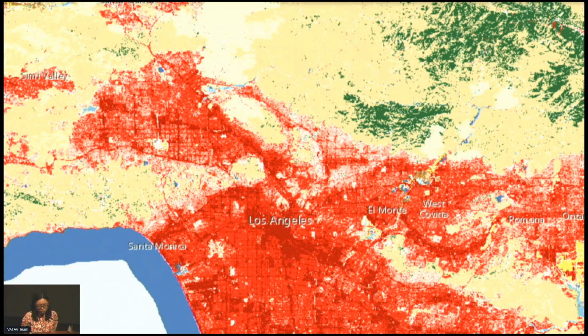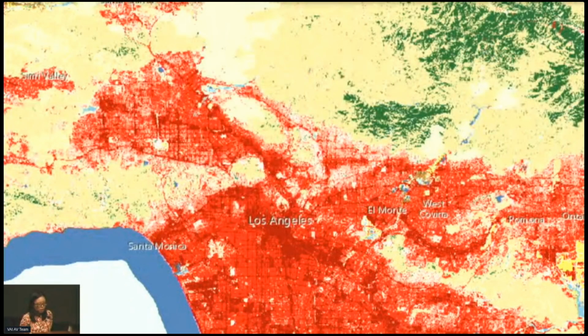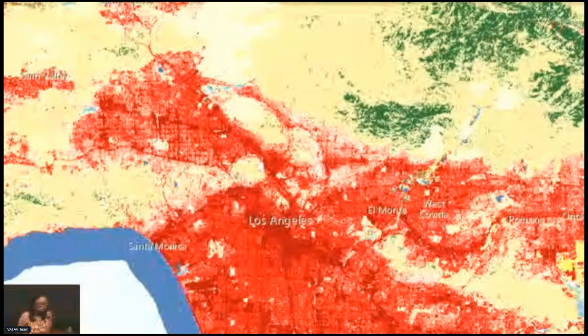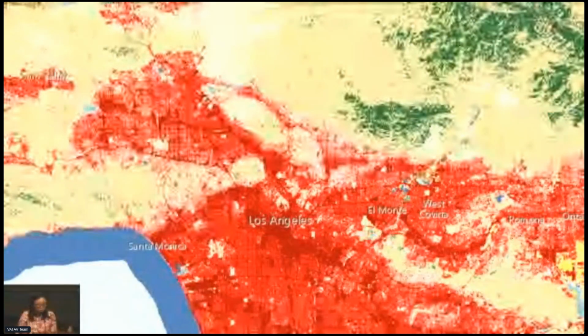Like shown here, raster data is an array. It's an image where each pixel in the array has values. But it's more general than your average photograph, because the image can have any number of channels, and the values at each pixel can also be categorical, as shown here.